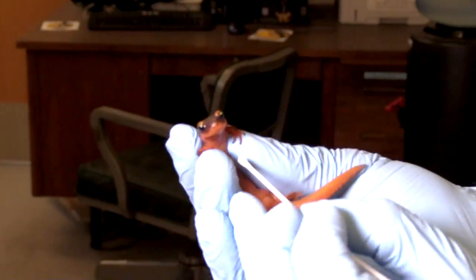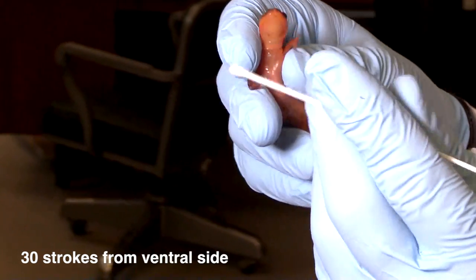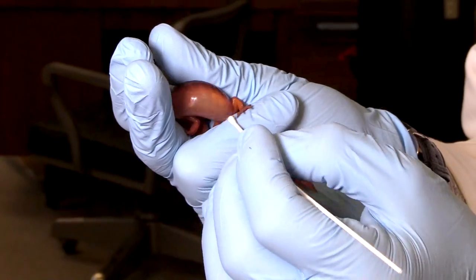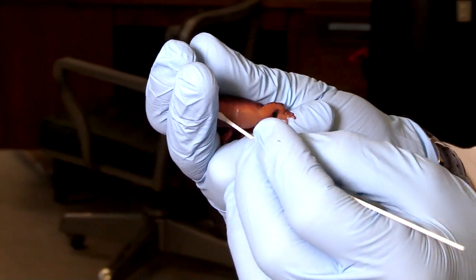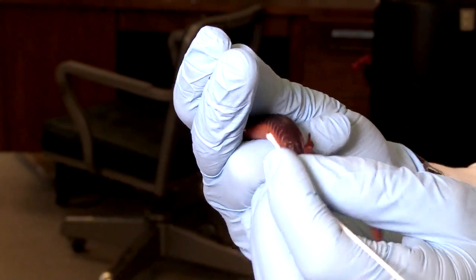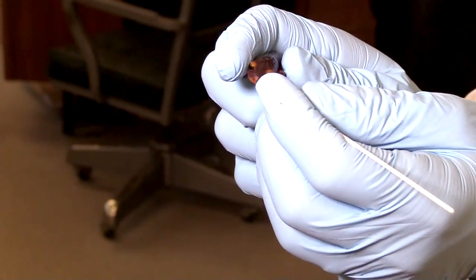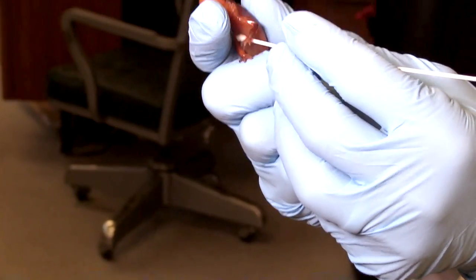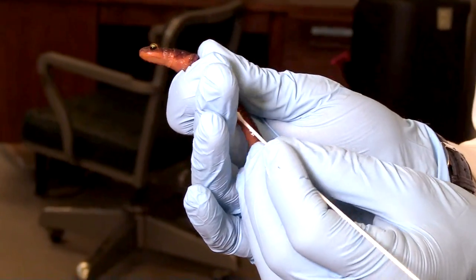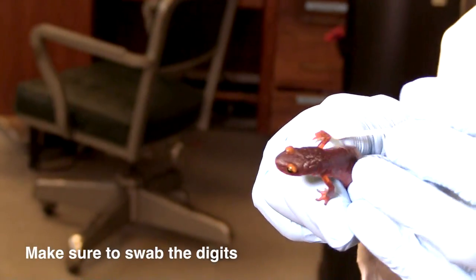I'm going to hold this animal up and take 30 strokes from the ventral side — the bottom side of the animal. Now I'm also going to try to swab his little fingers and toes as part of that.